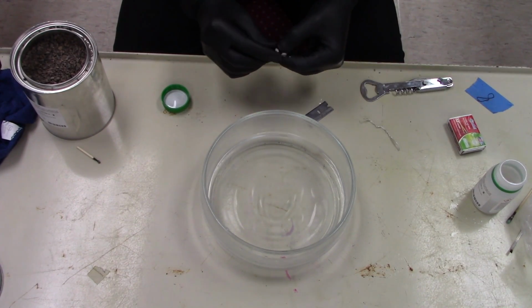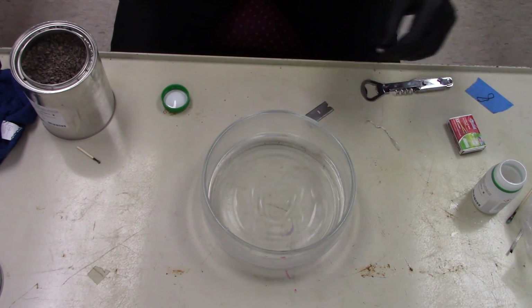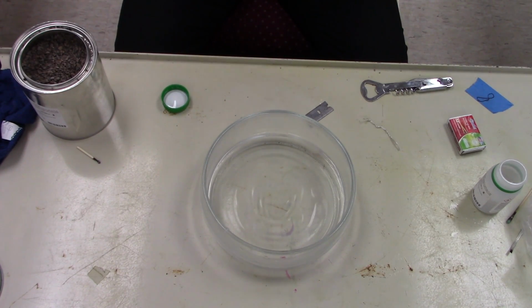Boom, so there we go. Now if I cut it in half, you can really see kind of the reflective metallic look of it. The outside of it gets dirty really quickly because it's highly reactive. Put your goggles on. Not only do they make you look cool, but they keep you safe. Ow.